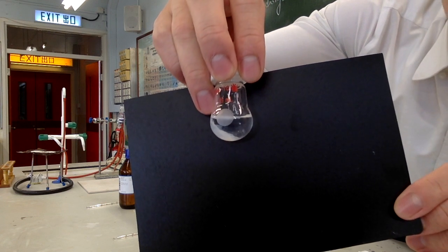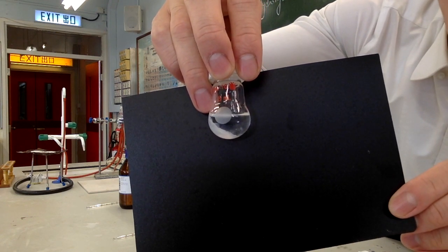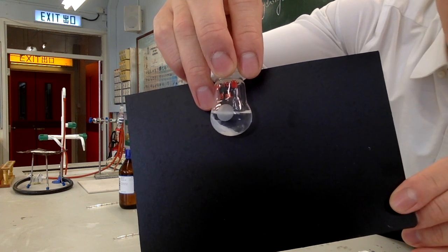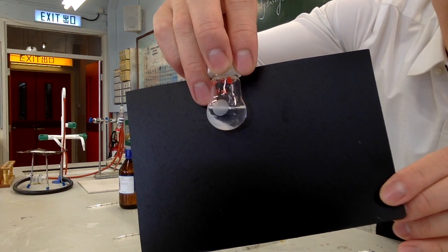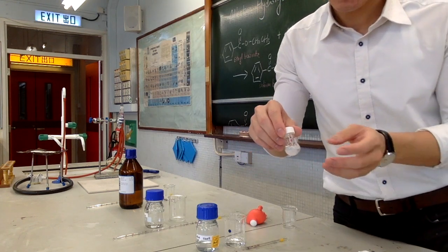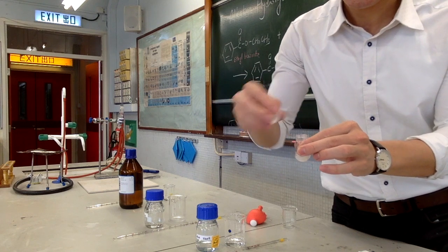You might also notice that there are actually 2 layers of liquids, and the reason why there are 2 layers of liquid is because the ester and the water of the sodium hydroxide doesn't mix well, so that's why it appears to have 2 layers of oily liquids. Now, before performing the reflux, we will actually add the anti-bumping granules.